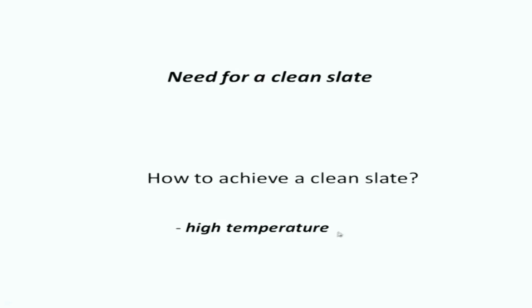There are three major ways in which this is done. One is you use very high temperatures, maybe 120, 121 degrees C for about 15 minutes under wet conditions, typically used. A high temperature can be used, and that achieves a clean slate. This has been shown repeatedly, it works very well.